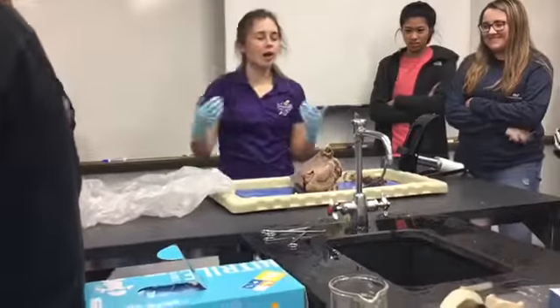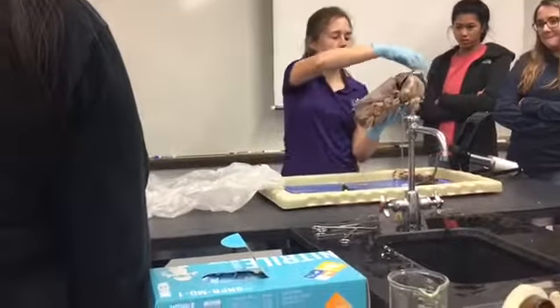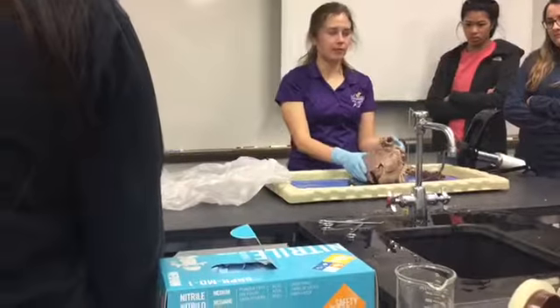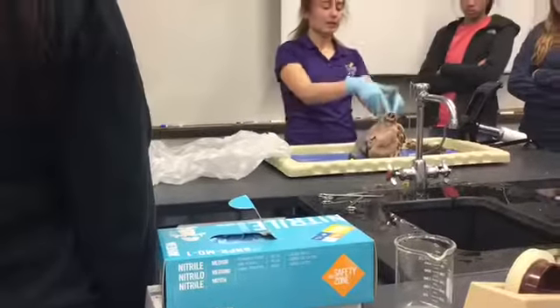Secondly, in humans, our lungs have different lobes. How many lobes does our right lung have? Three. Let's look here: one, two, three. How many lobes does our left lung have? Two. One and two. Tomorrow, we're going to take an ID quiz, and I'm going to separate the lungs.